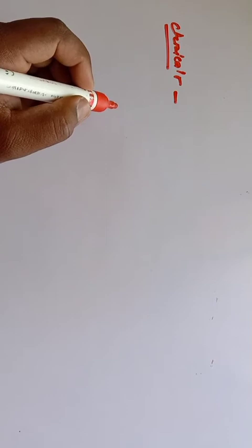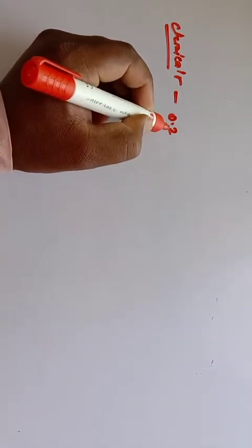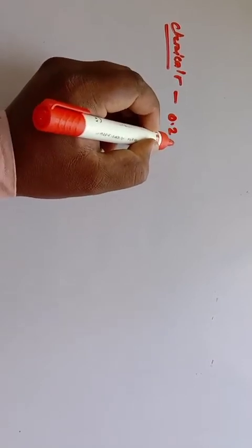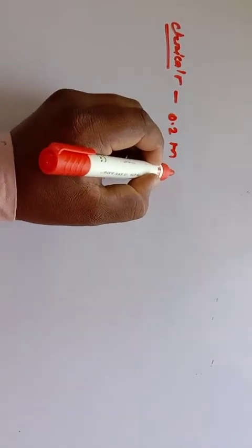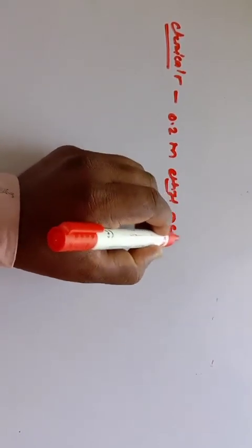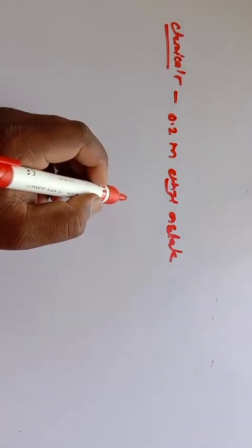So let us discuss the requirements. Which chemicals do we require for this experiment? We require 0.2 molar ethyl acetate, or methyl acetate, you can use either.